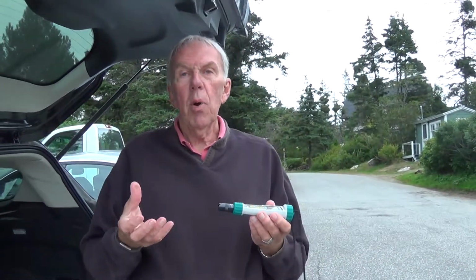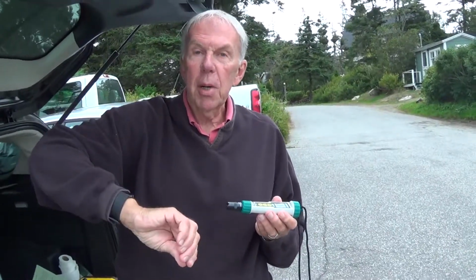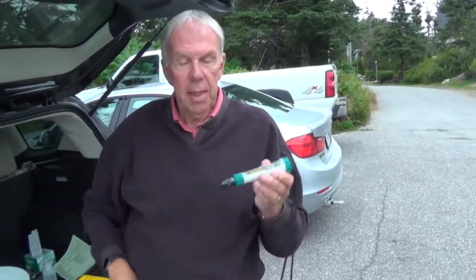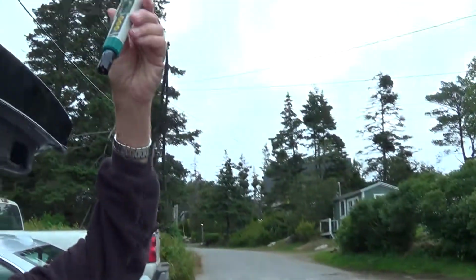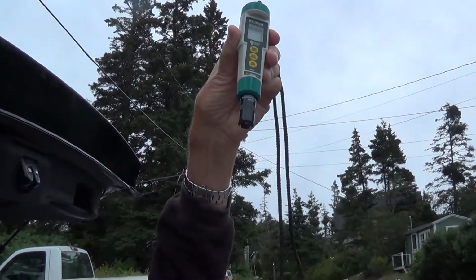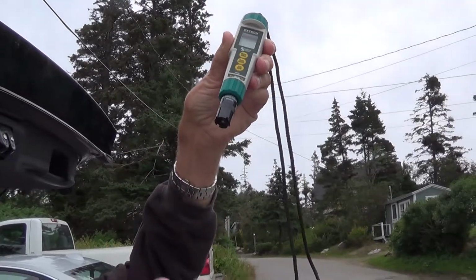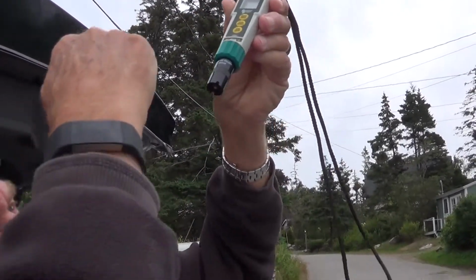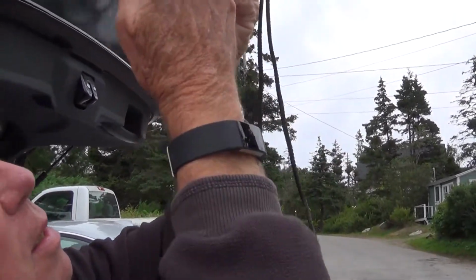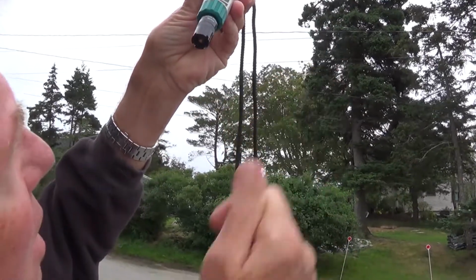Just like in a bottle of water, when you turn it upside down, the bubbles are at the bottom and then they float back to the top. The same with this, there's a fluid inside. So when you inspect this, I like to hold it up and look for the presence of bubbles. Now sometimes it's difficult depending on the light because you're holding it up towards the sky, but if at all possible, you can kind of aid that. And I don't see anything.